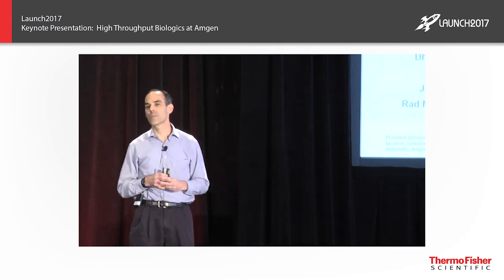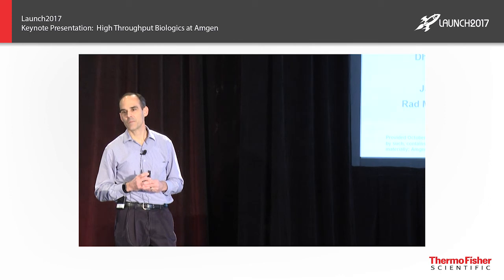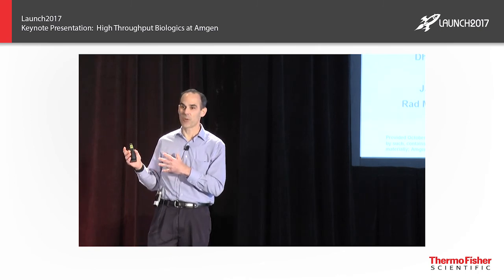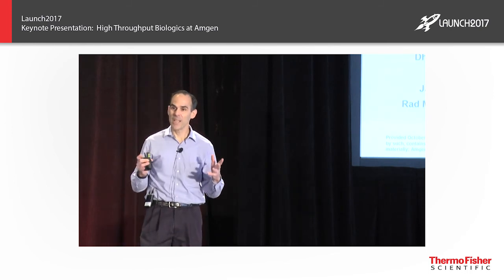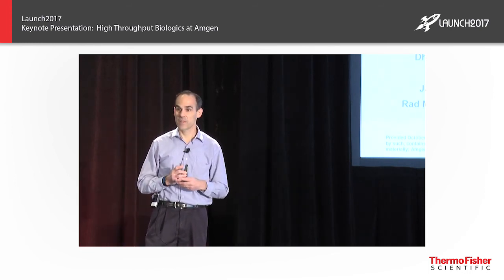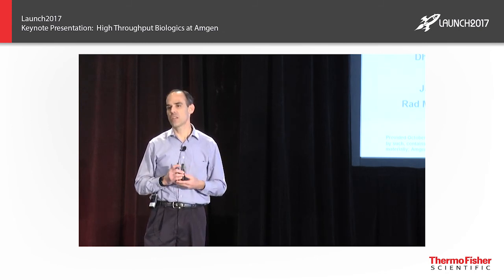I have to assume that a company like Amgen has a fairly large and heterogeneous collection of LIMS systems for management of lab information. Do you see in your future a reduction in the number of platforms that you're managing, and possibly a convergence toward a single or small set of LIMS systems? Yeah, absolutely. As a matter of fact, HTB has replaced a whole constellation of separate systems that we had. We're in the process of retiring these systems. There's probably over half a dozen of them that have been retired. And the more consolidation that we can do, the better.